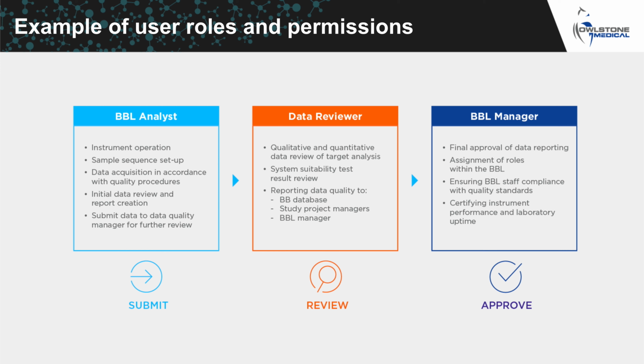For example, an analyst can process and submit data for independent review from a data reviewer. That reviewer can then make sure all the system suitability checks have passed and ensure data quality. This can then be sent to approval for the lab manager to guarantee high quality service and faster turnaround.